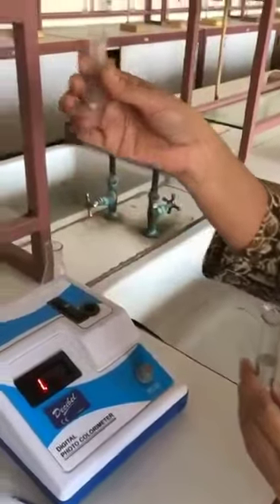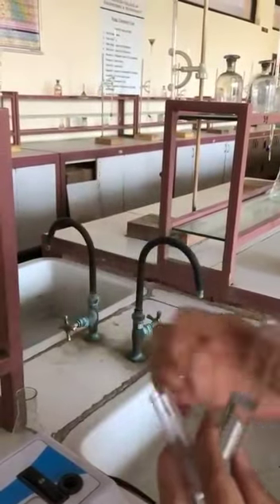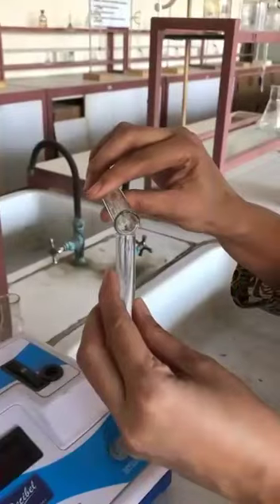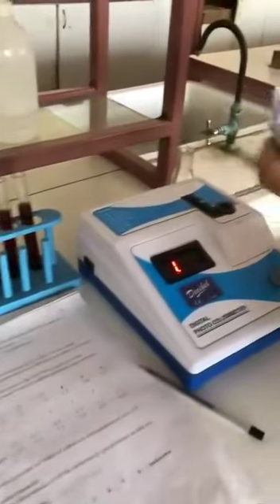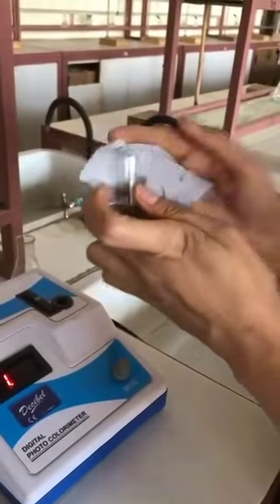This is the cuvette. We have to fill this up to the 3/4 mark. Now, you have to dry this cuvette with the help of filter paper.